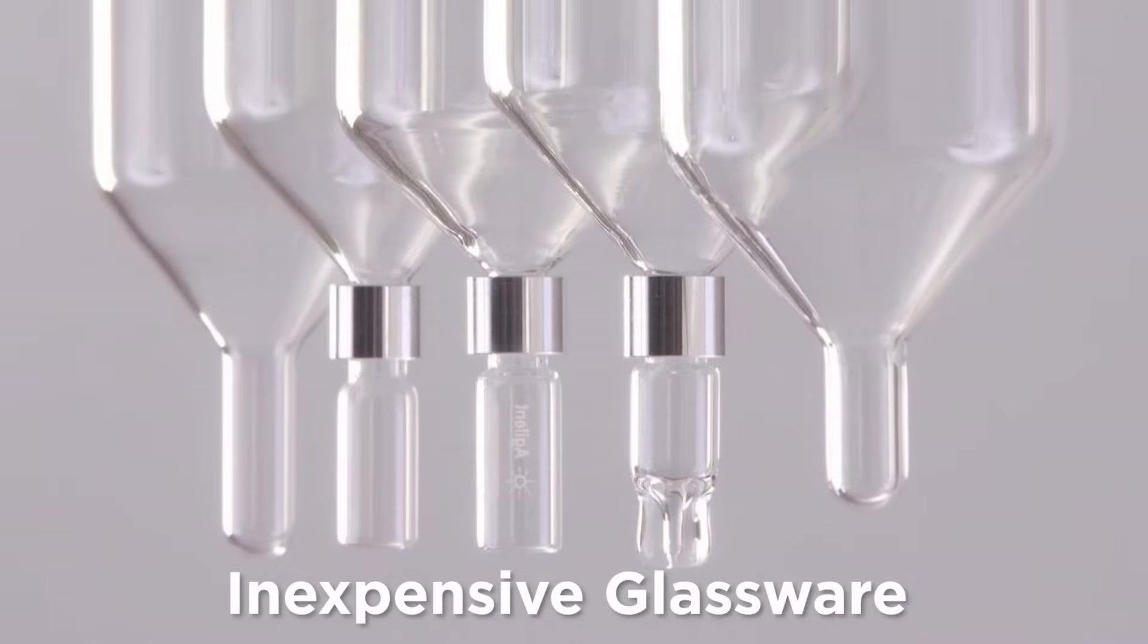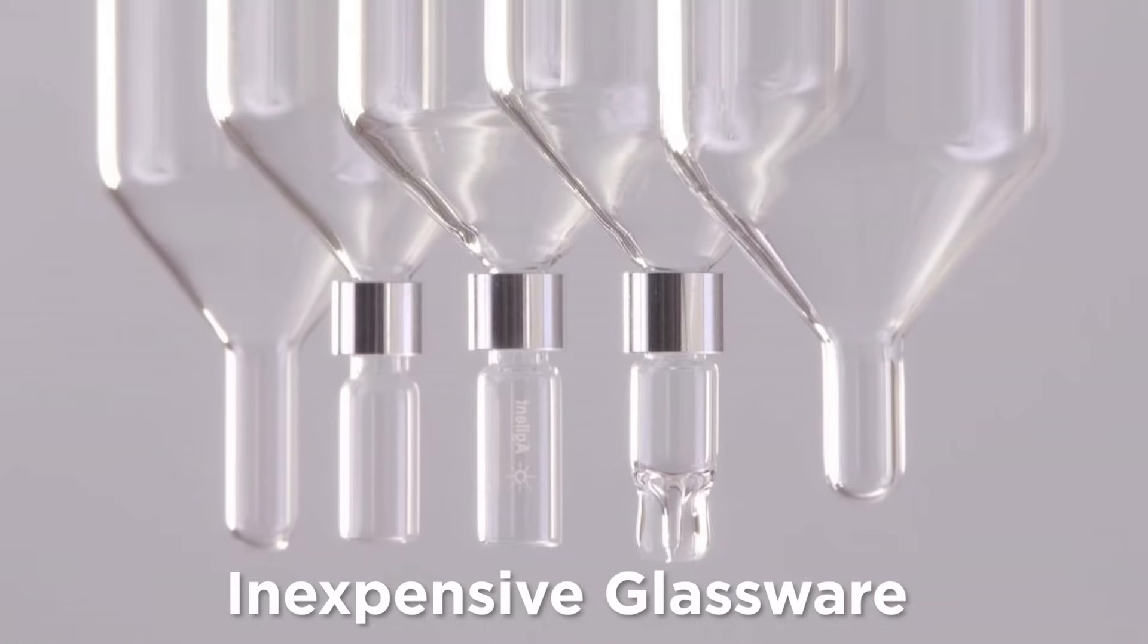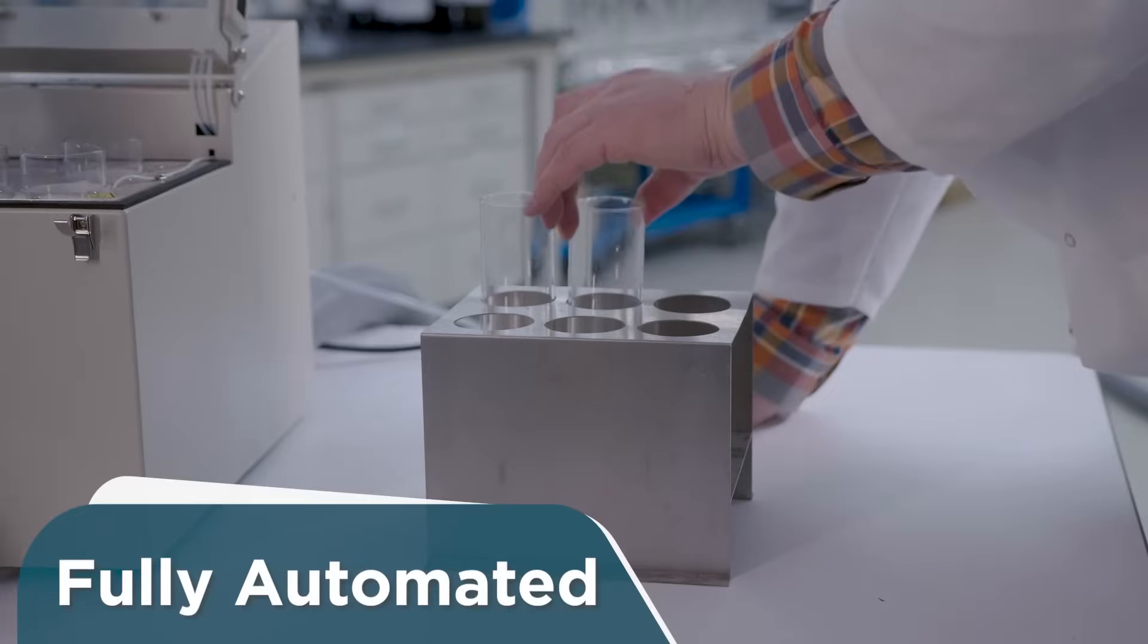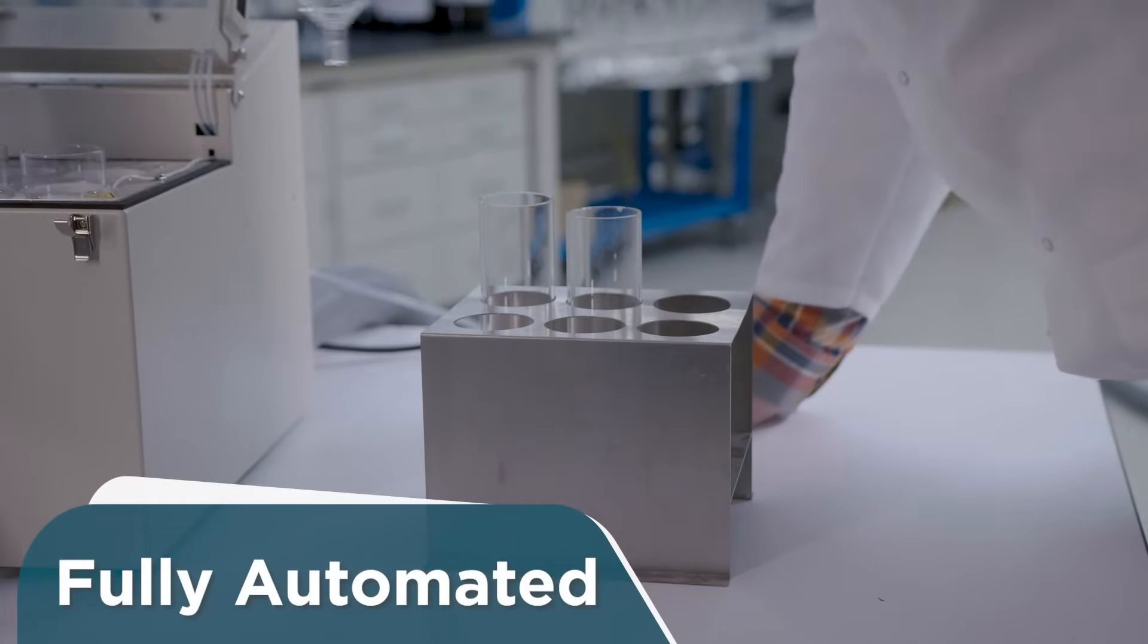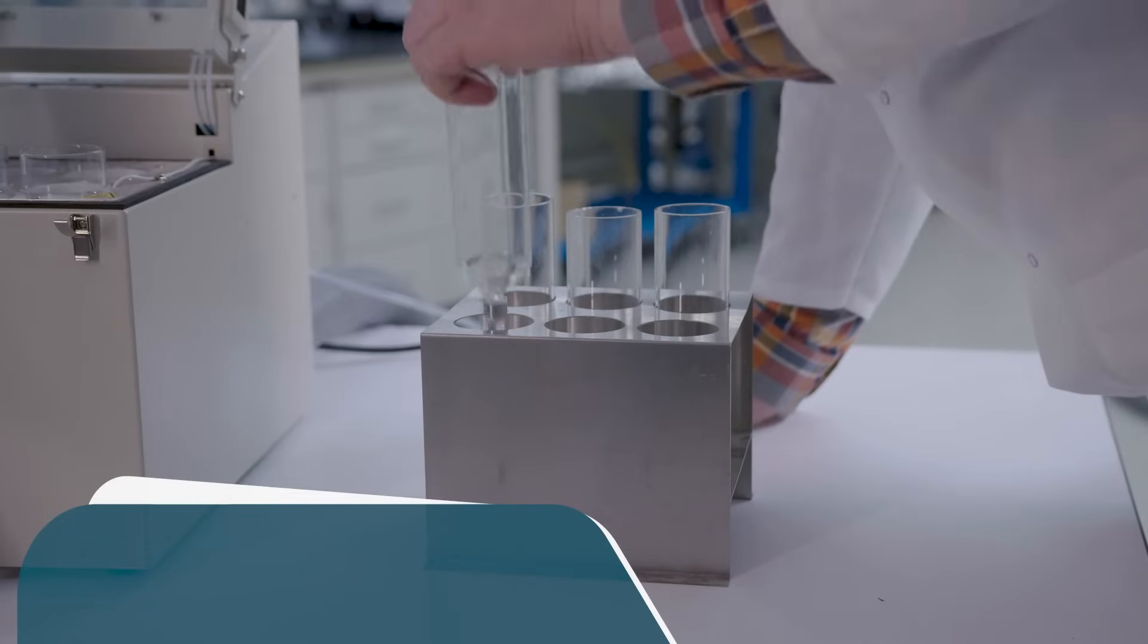Economically priced vessels in 500 microliter, 1 milliliter, and direct-to-vial. Automatic endpoint detection, nitrogen shutoff and alarm for each vessel. Programmable end-by-time.